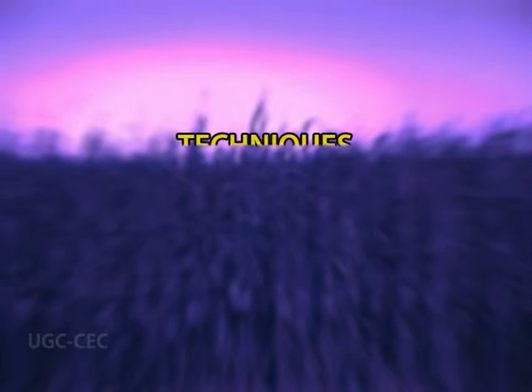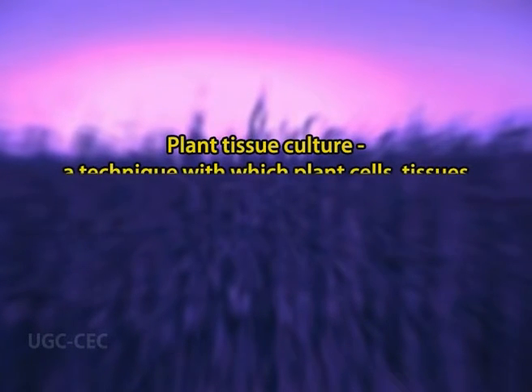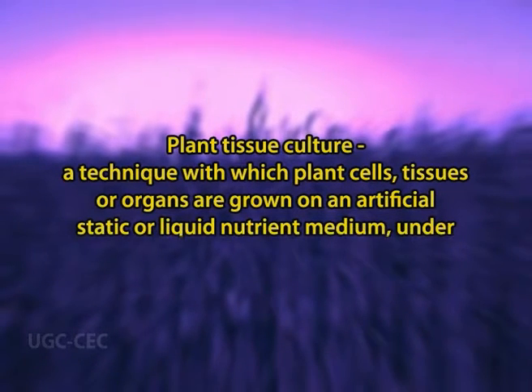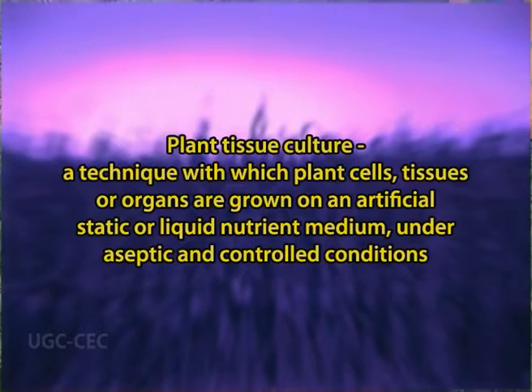Hello dear students. Today we will discuss an important topic which is techniques of plant tissue culture. Plant tissue culture is a technique with which plant cells, tissues or organs are grown on an artificial static or liquid nutrient medium under aseptic and controlled conditions.